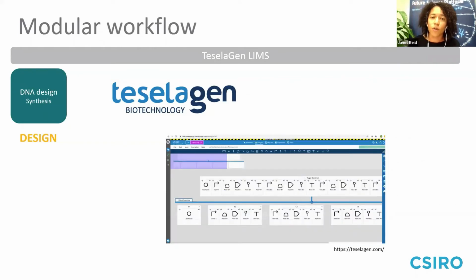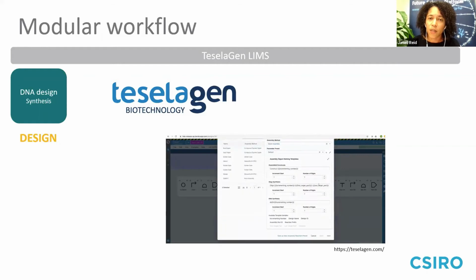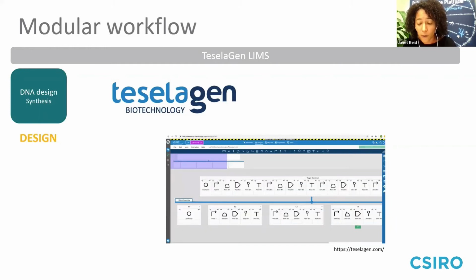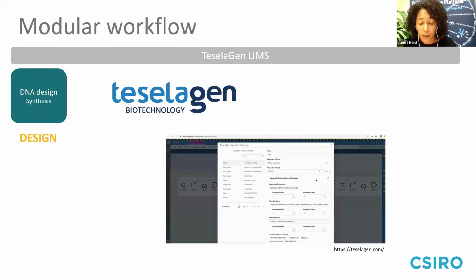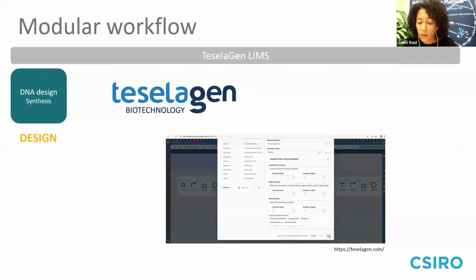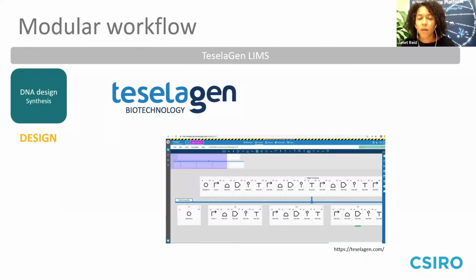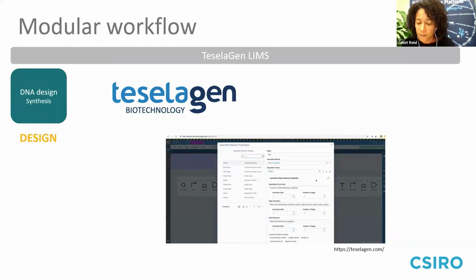The other Teselagen module that we use, the build module, is essentially a LIMS system, laboratory information management, a massive inventory and workflow management system. In it, we can enter all our laboratory equipment, track the storage of items, track change of states of samples, use of primers, dilutions of aliquots, transformation of DNA into organisms and recovery back out again. Workflows can be planned in this software and executed, generating plate maps and integrating our automation.